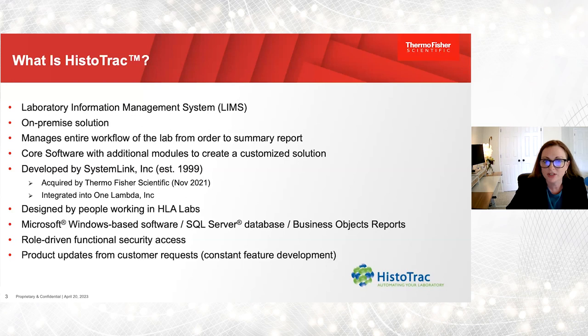HistoTrac, because it is a laboratory information management system, it will manage your entire workflow. So from the time that the sample is accessioned, to ordering a test, to the summary report, all of that workflow is managed within the system. We sell the system based on a core software. And so the core software would do everything from creating the patients, giving them samples, ordering tests, and then at the end of that outcome, giving you essentially a report to give to your clinicians. But we recognize that that's not a one-stop solution. So we have ways to customize that solution to make sure that we give our customers exactly what they need.